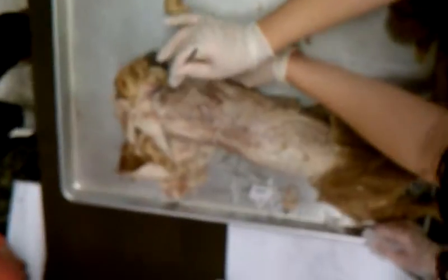And then you have the spinos. You see this big muscle right here? It's kind of triangle shaped. That one's the spinotrapezius. And then here, this one that's kind of coming toward his armpit, that's his spinodeltoid. Okay? So I'm going to count down through them one more way. Clavotrapezius, acromiotrapezius, spinotrapezius. Clavodeltoid, acromiodeltoid, spinodeltoid. Okay, not too bad.